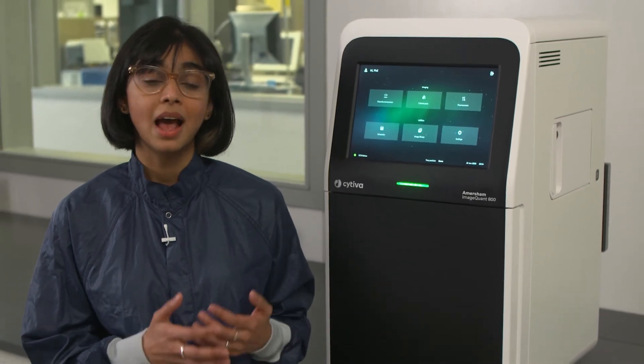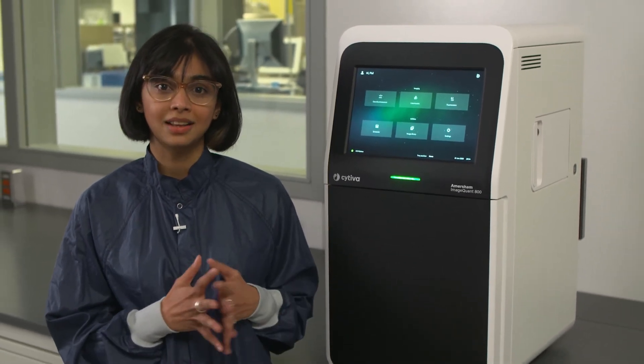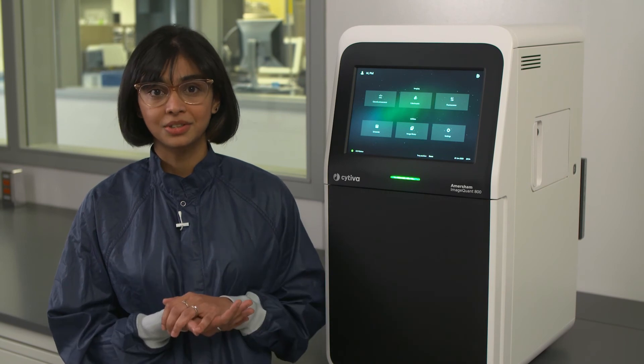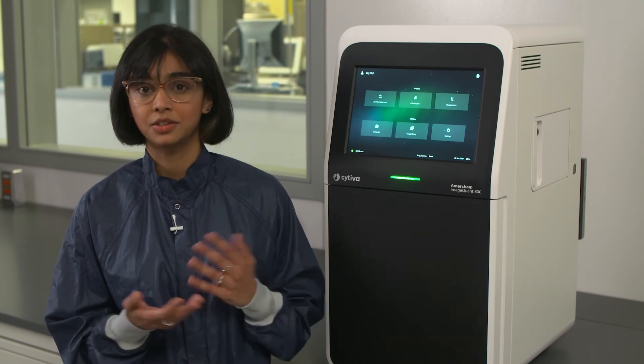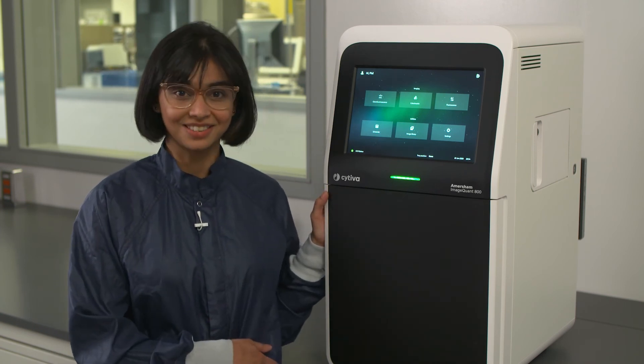It also comes equipped with a fully automated exposure mode called Snow, which extends the dynamic range of the system, and we'll discuss more about this a little later. I also want to introduce you to my colleague Phil Beckett, who will be taking you through more training videos so you can learn more about how to use the ImageQuant 800 system.